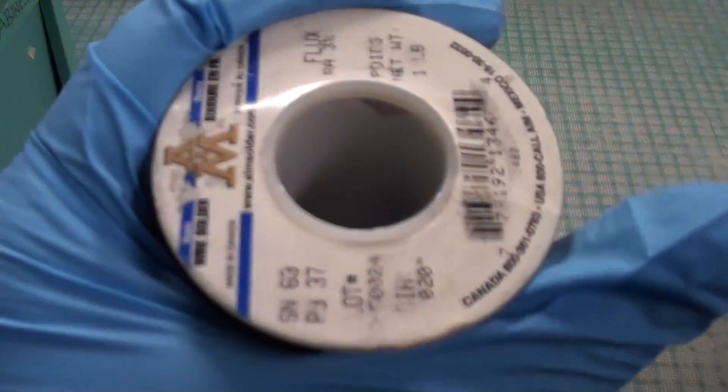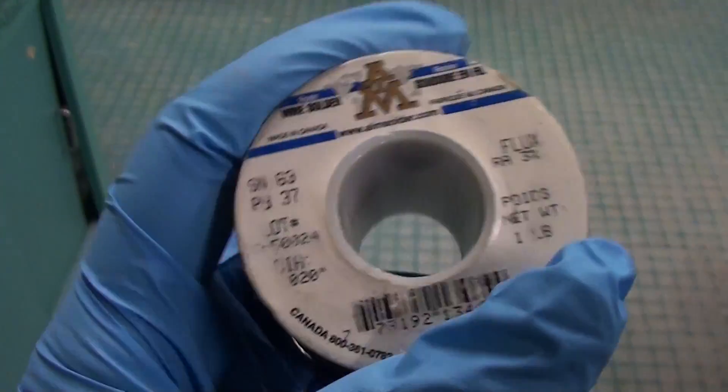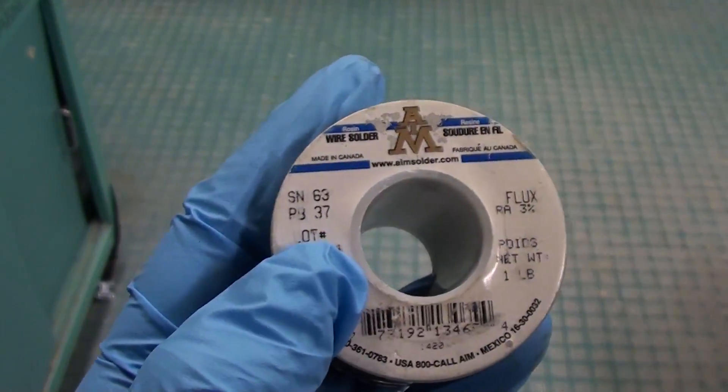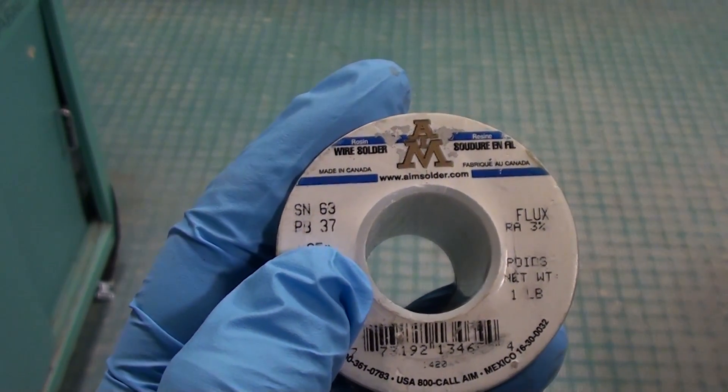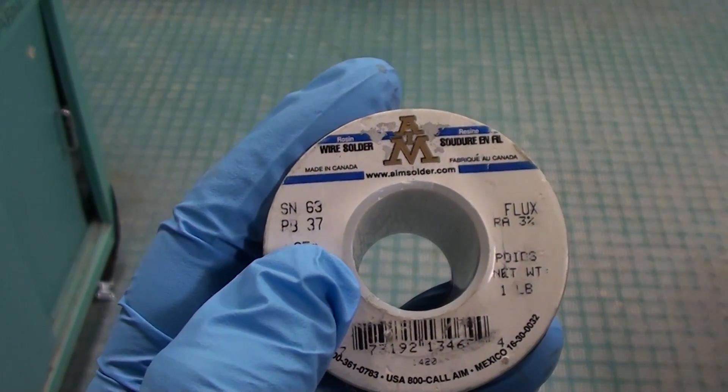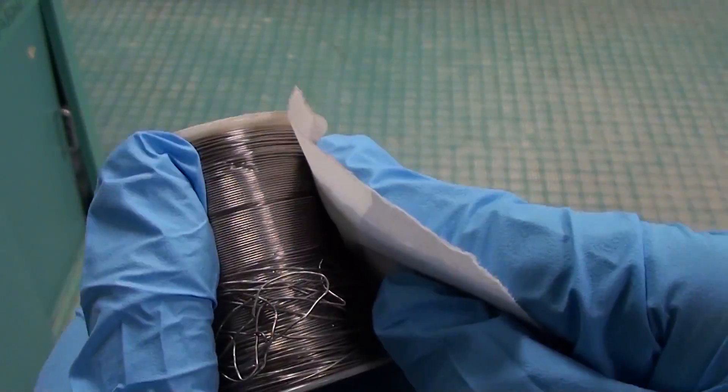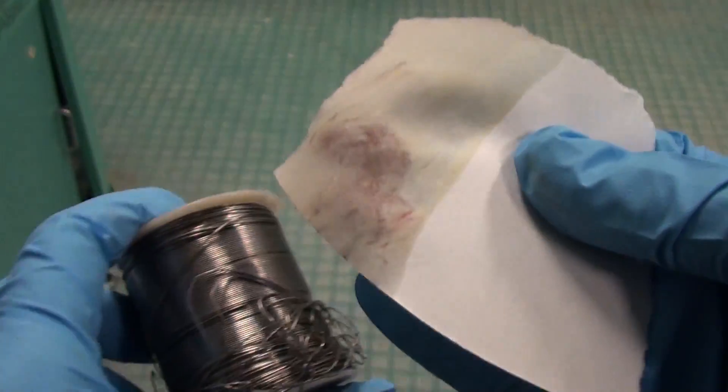Let's try something more common now. I have here some lead based solder. It's hard to see but the label says it's made of 63% tin and 37% lead. Let's rub the test paper and there we go, a clear positive for lead.